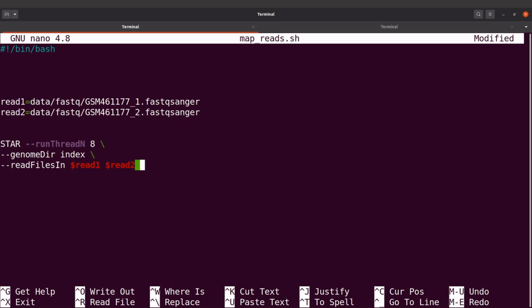So just make sure to contact, because ideally, if you are doing RNA Seq data analysis, you may have lots of samples. Maybe you may have 10, 12, maybe 20, etc. So you need to find a way to automate the process. This approach here, I wouldn't recommend it if you have lots of samples, but because we have 2 samples, that is why I'm using this approach. So take note of that.